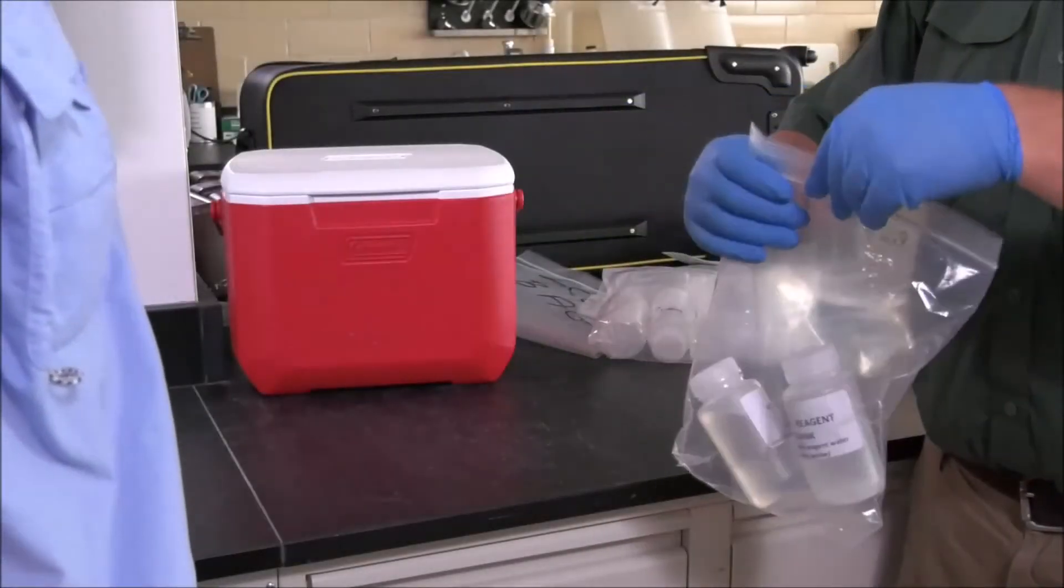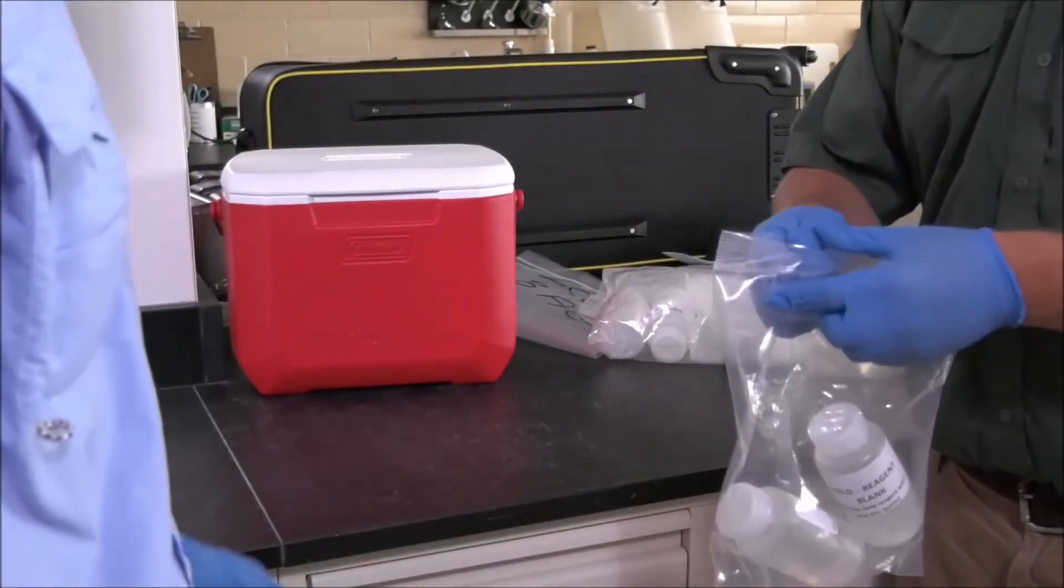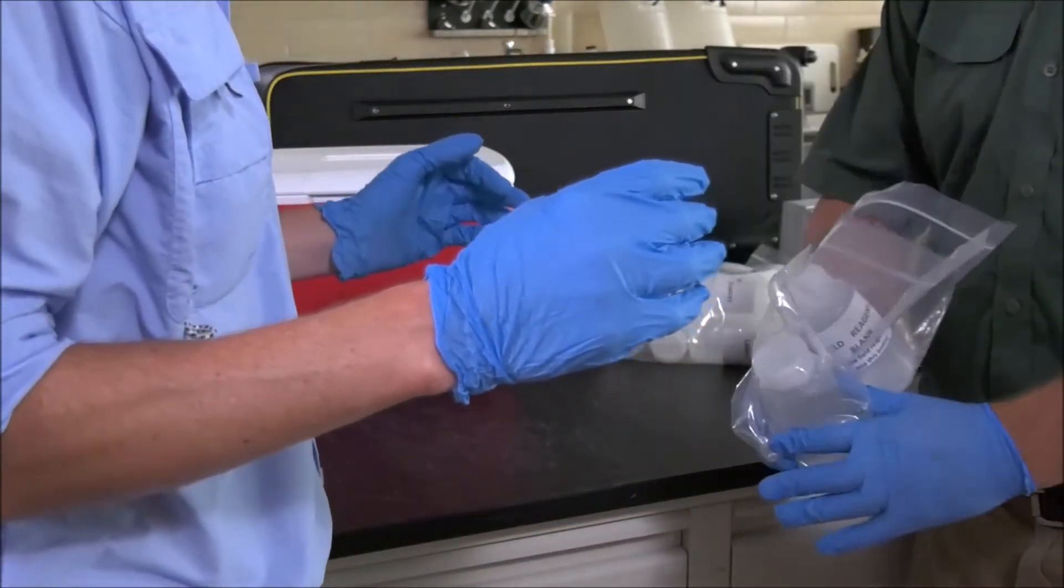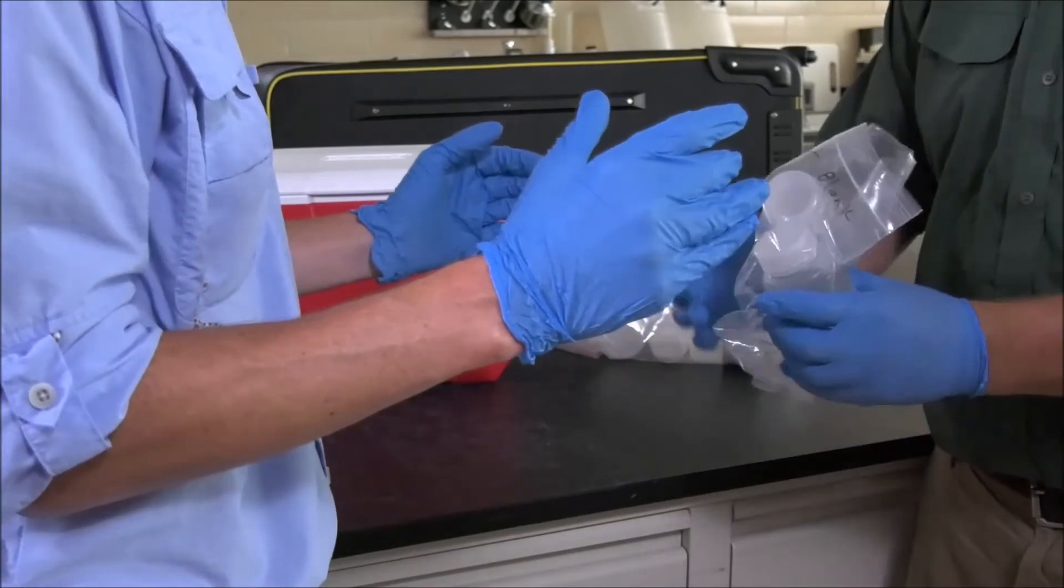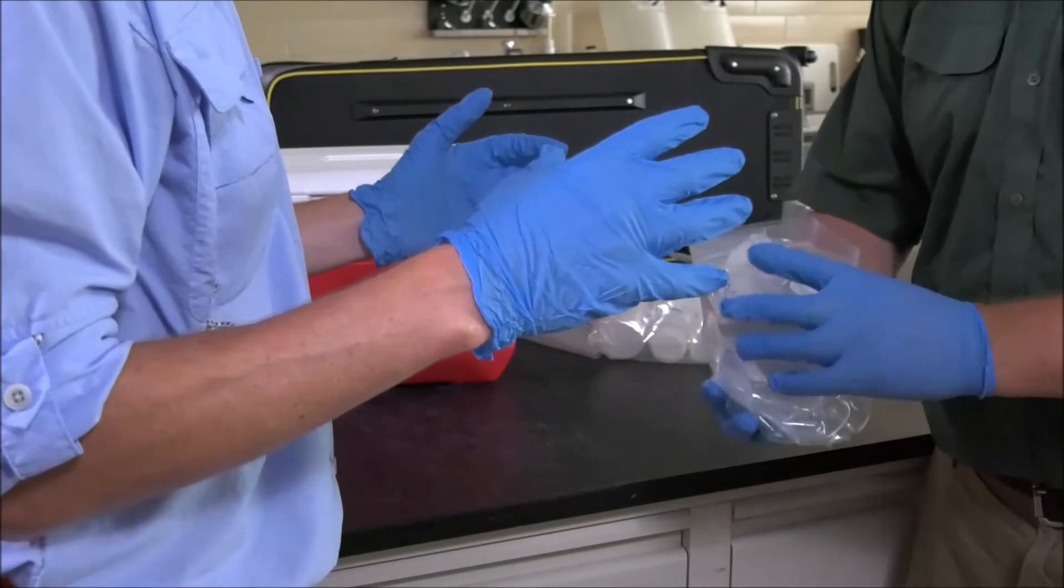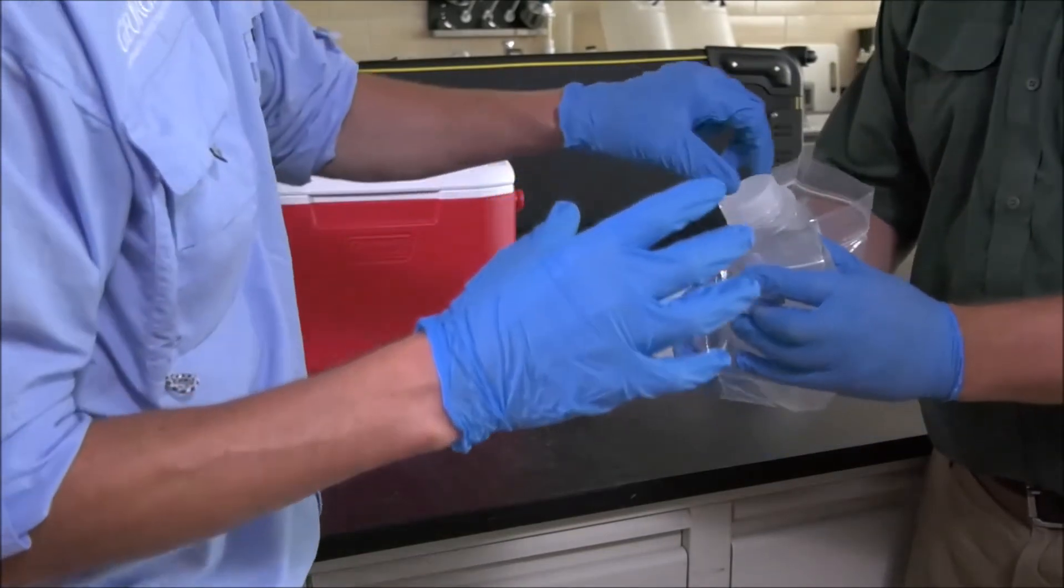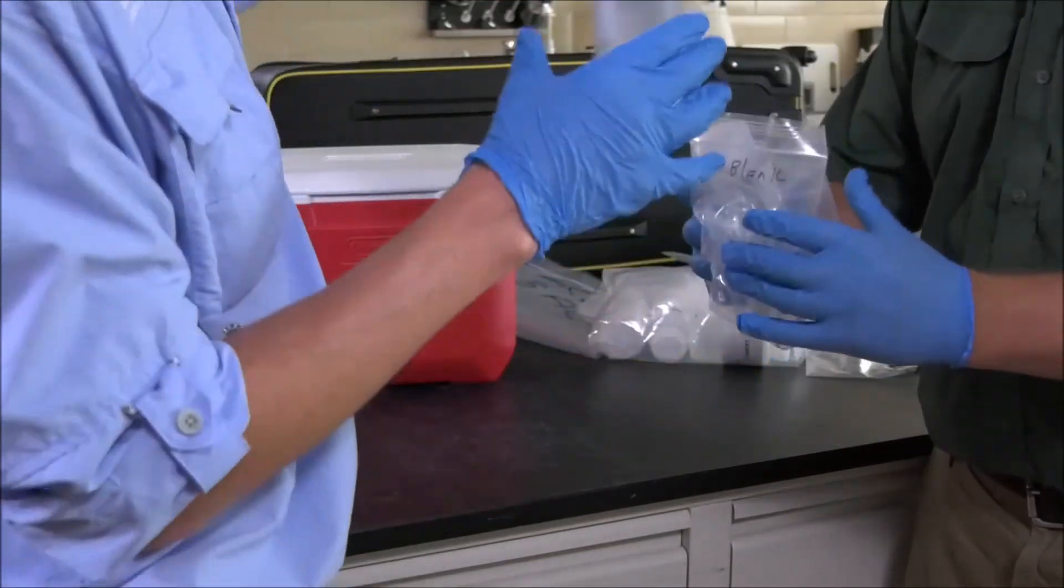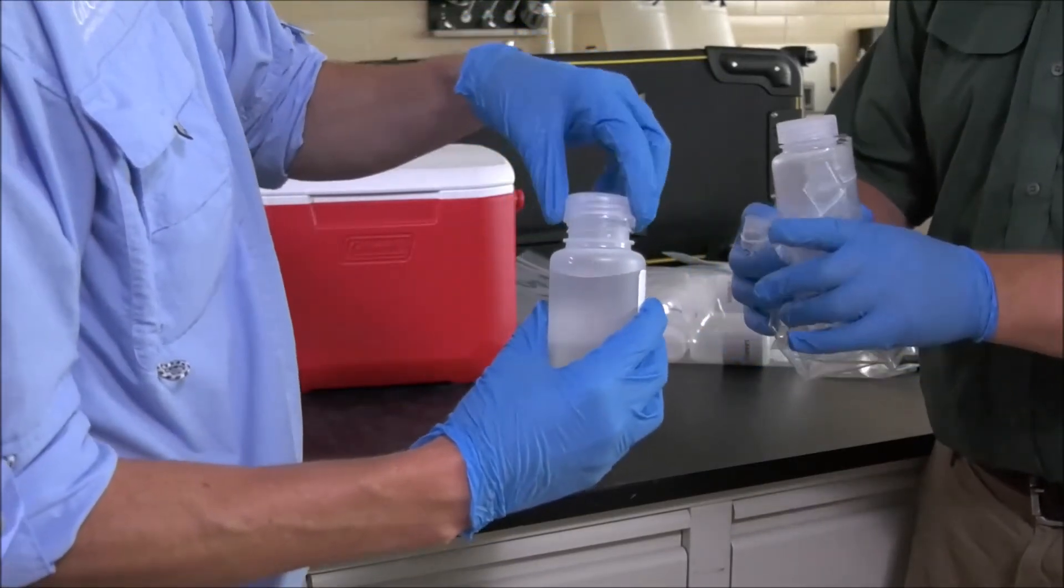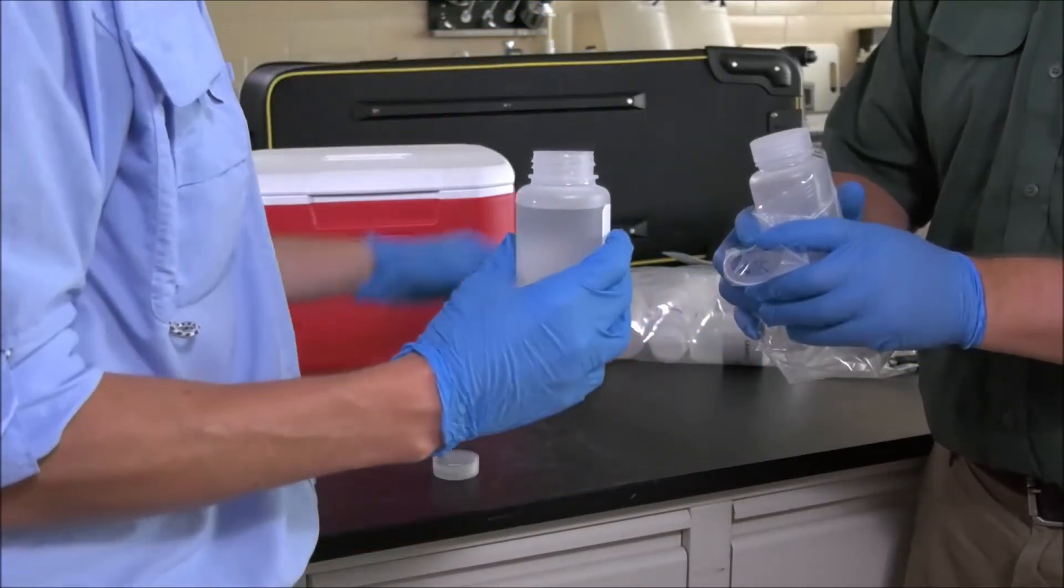Dirty hands removes one of the plastic bags containing field blank bottles from the cooler. Without touching the bottles, dirty hands will move the sample bottles to the opening using the outside of the plastic bag. Clean hands will remove a full field blank bottle from the plastic bag by touching only the cap of the bottle. They will remove the cap from the field blank bottle filled with water. This cap may be placed on the counter.